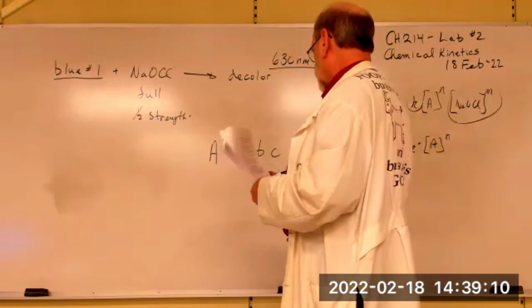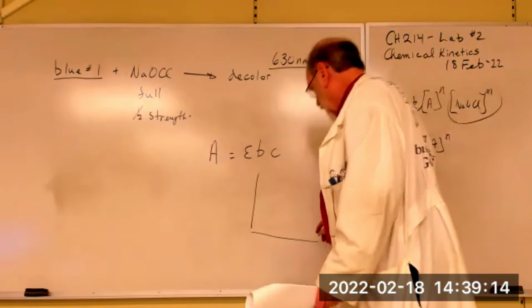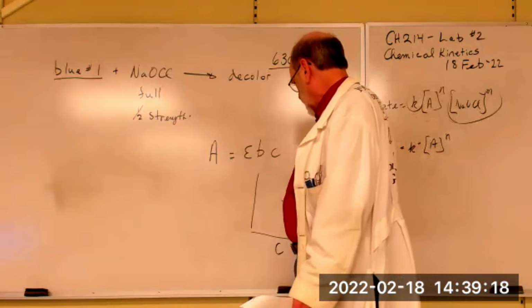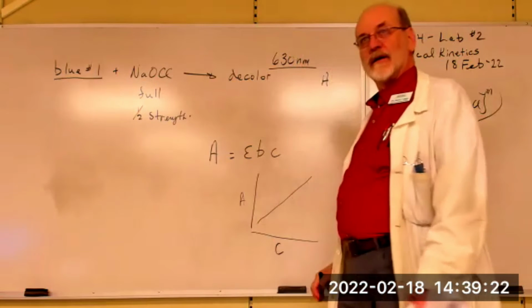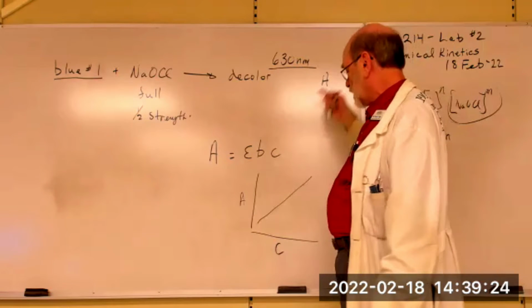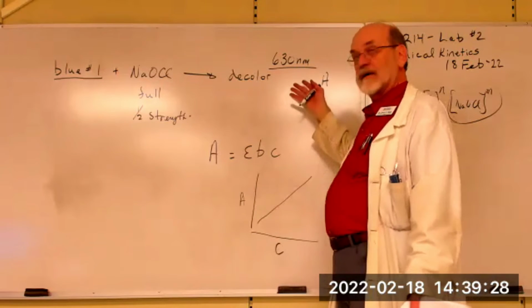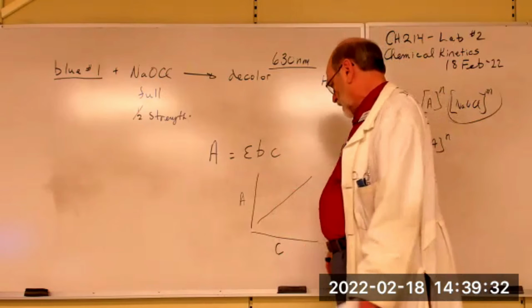But as a practical matter, as the concentration goes up, the absorbance goes up linearly. So that's why we can use absorbance instead of actual concentration values for our calculation. We're going to use absorbance. It's easier to measure.